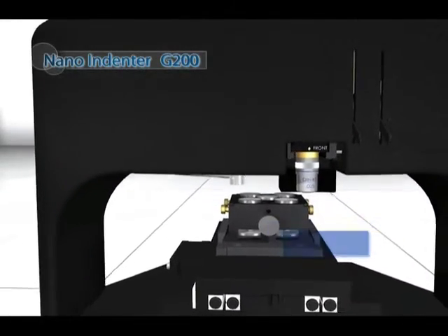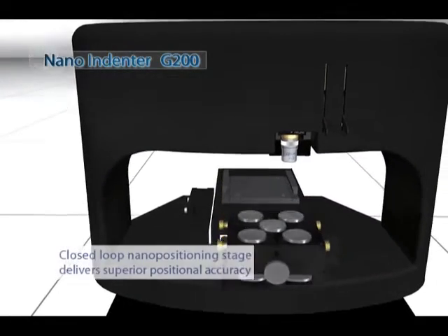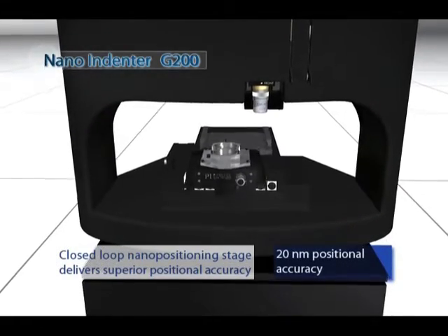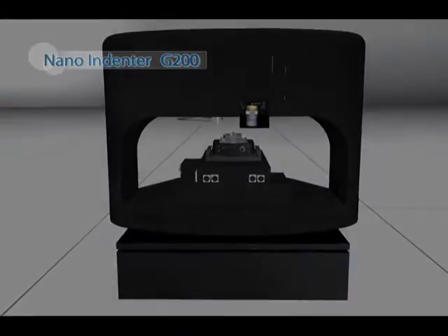For samples that require even higher positional accuracy, the closed-loop nanopositioning stage enables scanning probe microscopy in support of mechanical testing.